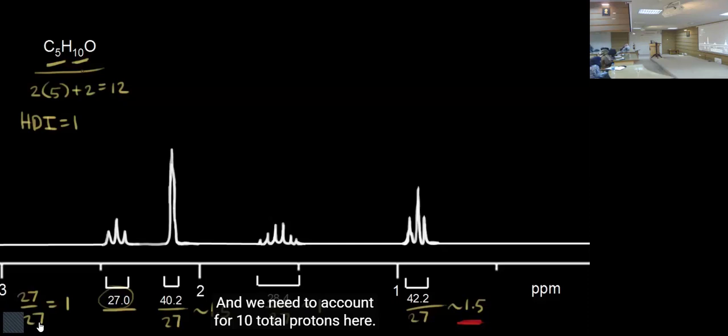Proton NMR is the most sensitive NMR technique among all NMR, because 99.998% of protons are NMR active nuclei. That is why it is very sensitive. So all types of protons, even an impurity, you will be able to observe. But maybe it's just hidden behind your peaks.